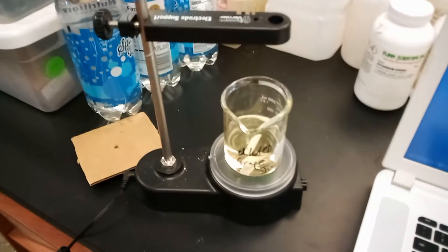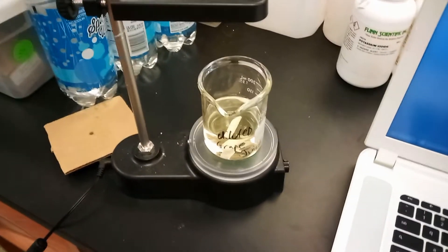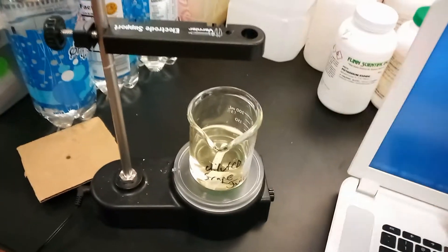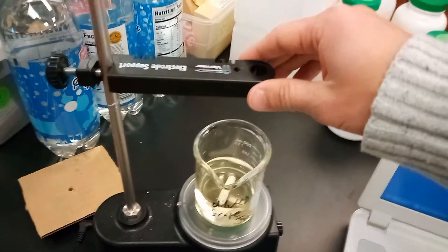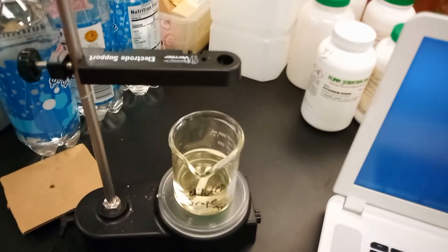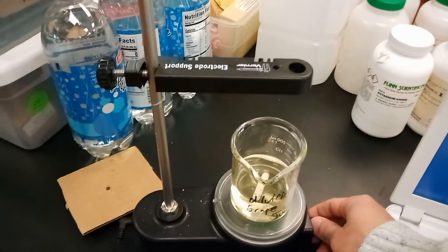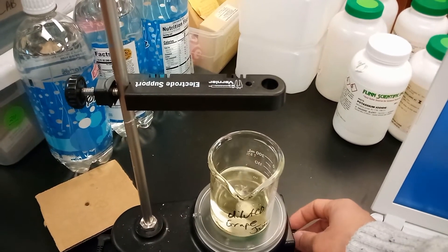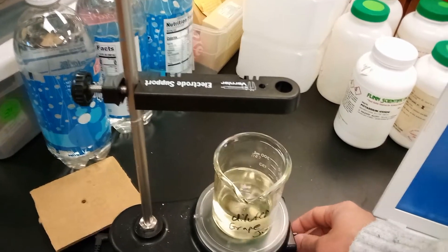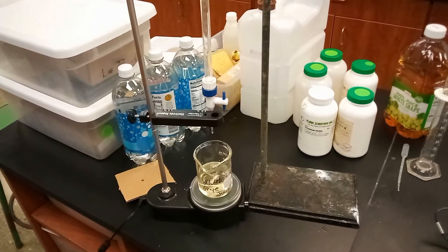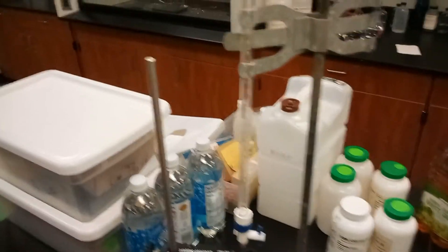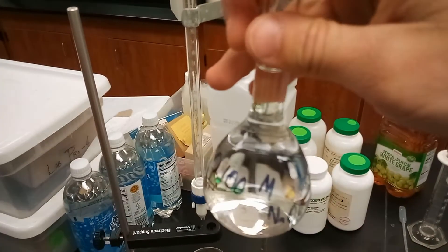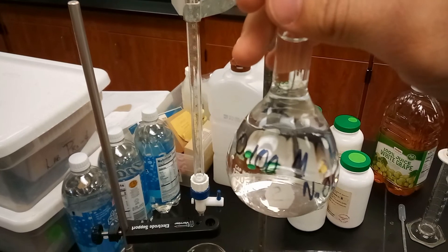The thing that you want to do is set up our beaker of diluted grape juice onto one of these stands so that we can put a pH probe in it, as well as having the burette over it. You want to make sure that it's on so that you can spin this and the base will mix together. As we just mentioned, you're going to want this burette here, and you're going to want to fill it with 0.1 molar sodium hydroxide.